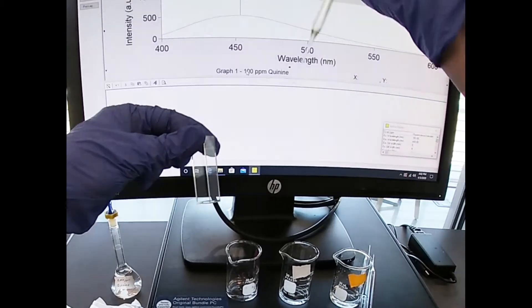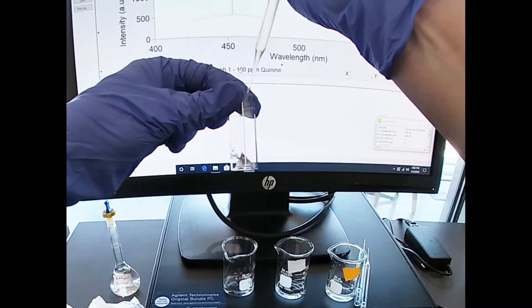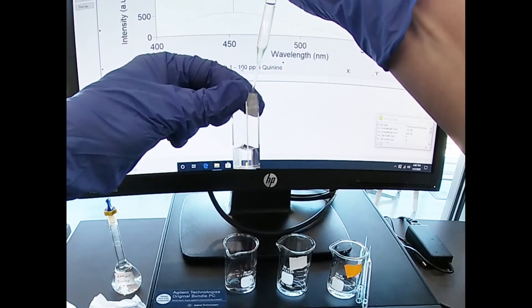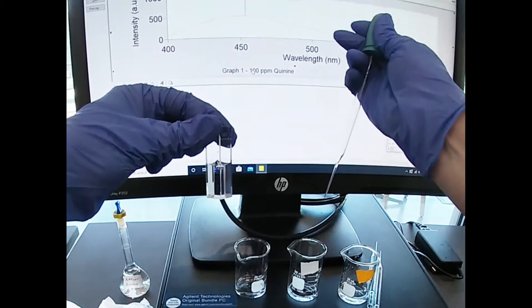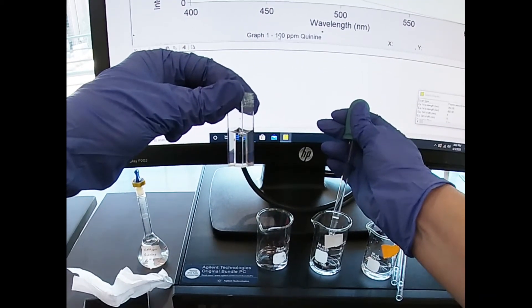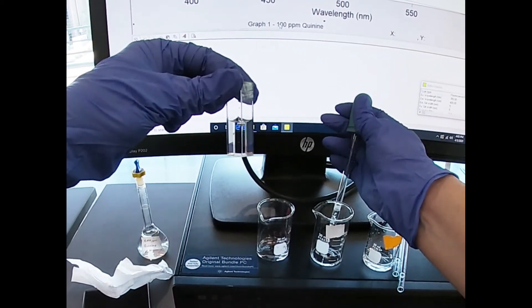We're using a four-sided quartz cuvette, and that's significant because if we don't use quartz, we're not transparent in the UV range, and 350 is right on the edge of the UV range.